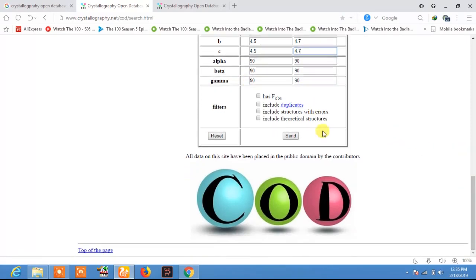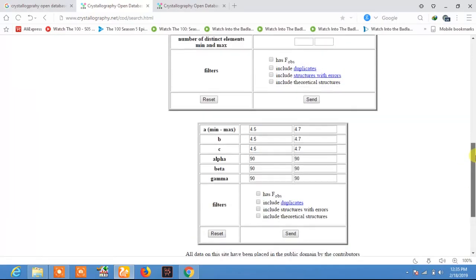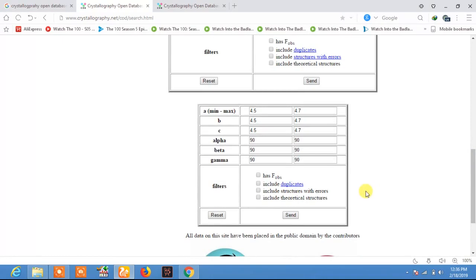Now just click — there is a filter section with options: include duplicates, include structures with errors, include theoretical structures. We are not going to include theoretical structures; we are only searching for experimental structures of TiC. We have filled in the form, so now just click Send.